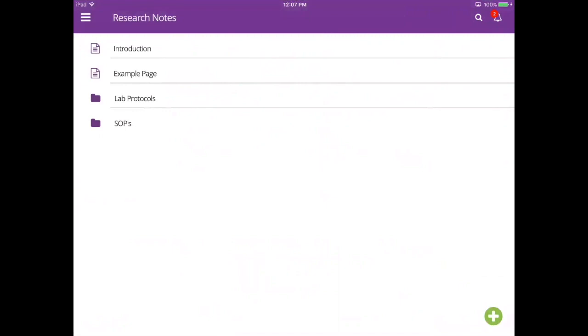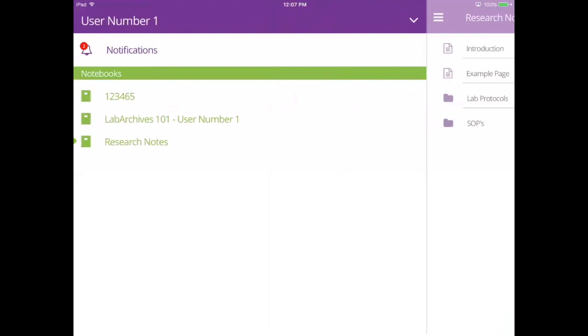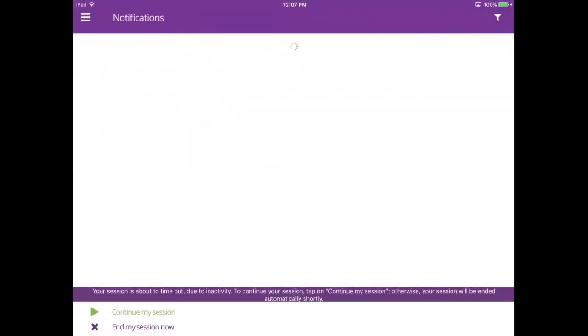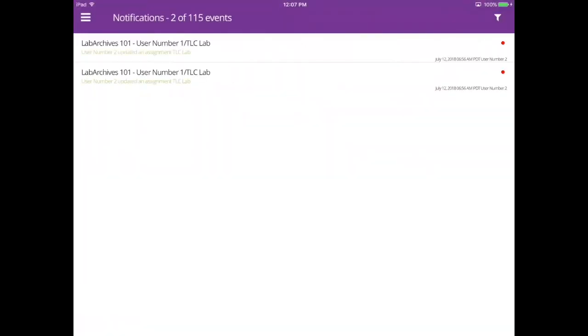If notifications are turned on in app settings, you can view any pending notifications at the triple bar menu. Notifications will let you know when someone has commented on an entry, or if you're a student, you can receive notifications regarding graded assignments.